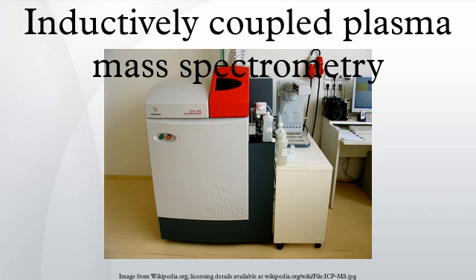SDS-PAGE, two-dimensional gel electrophoresis or chromatography is used for separation of MeCAT labeled proteins. Flow injection ICP-MS analysis of protein bands or spots from SDS-PAGE gels can be easily performed by dissolving the gel after electrophoresis and staining of the gel. MeCAT labeled proteins are identified and relatively quantified on peptide level by MALDI-MS or ESI-MS.